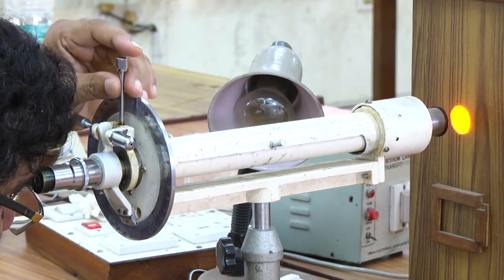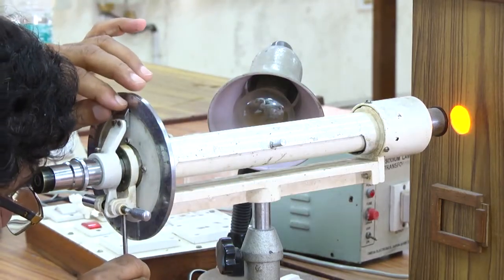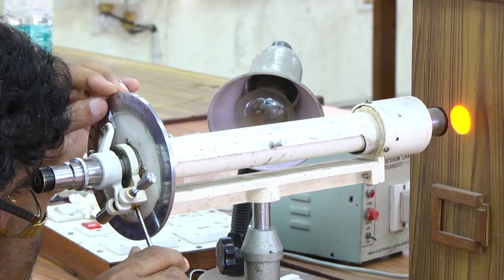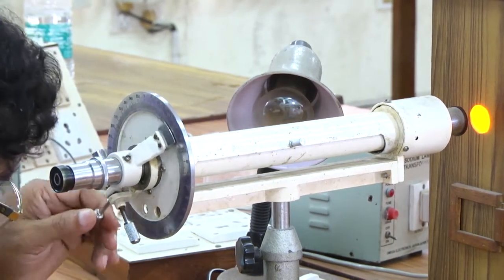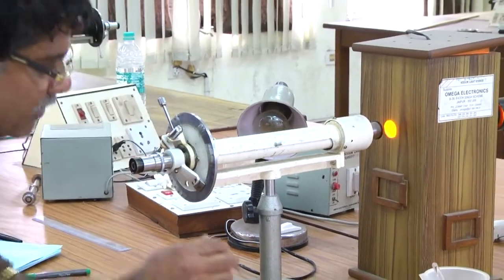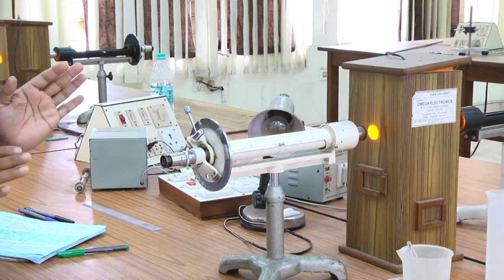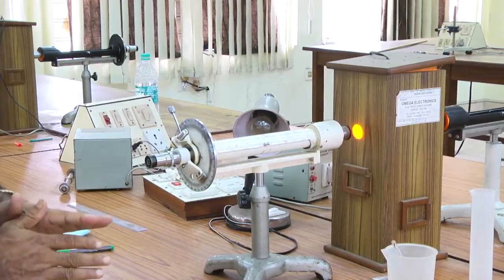So, I will set at a... yes. I will find out the first illumination, say uniform 1. I think this is the position I will note down, and another reading I will take just 180 degrees opposite. Yeah, this is the other position I am getting. Yes, uniform illumination. So, I have to take this reading. This is the R0 reading, okay, for uniform illumination 1 and uniform illumination 2.